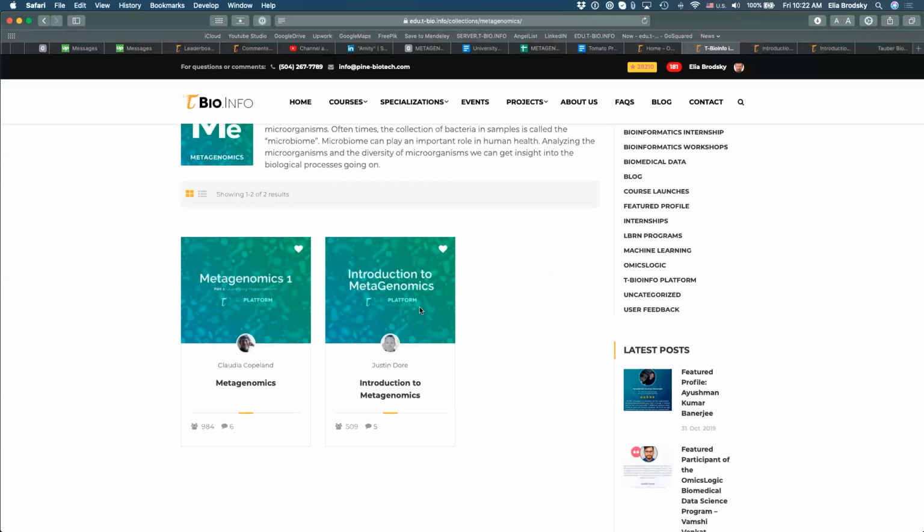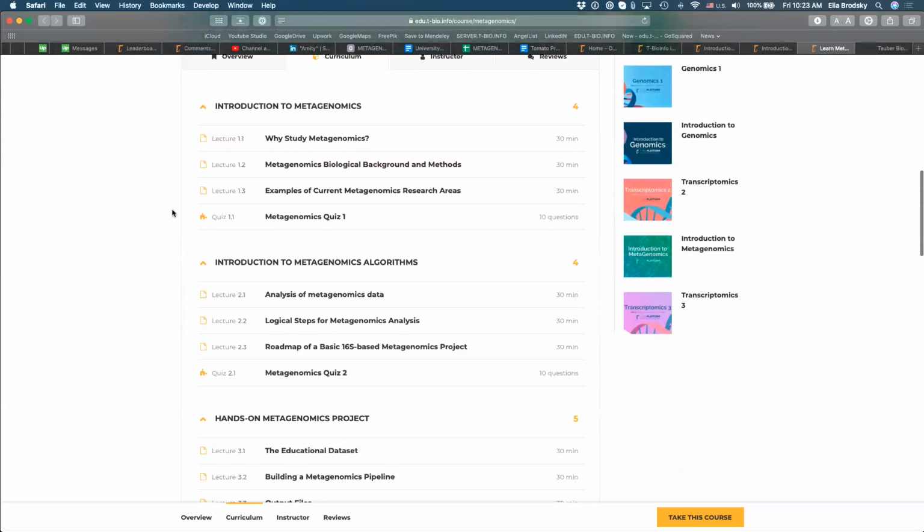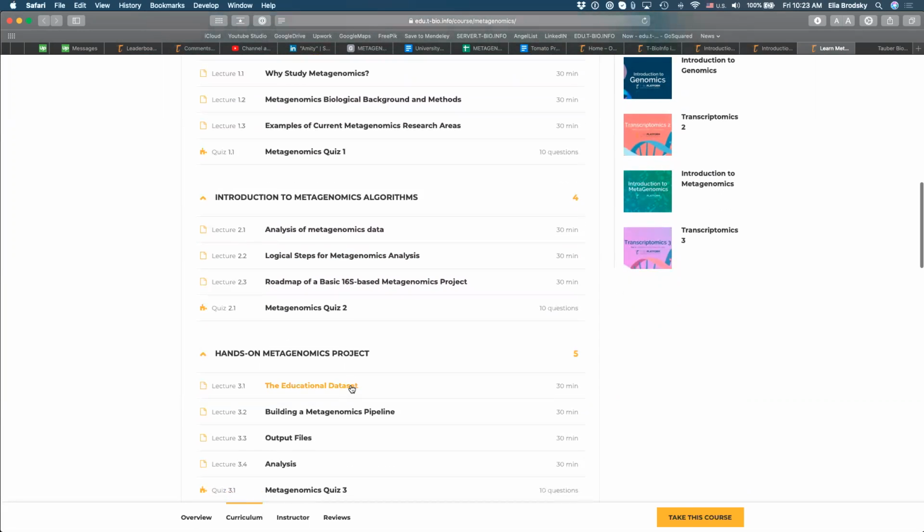And also, the Metagenomics 1 course will cover some of that information, more for logical steps of different types of metagenomic sequencing, including some example data sets. So you can look at some examples of where 16S ribosomal RNA is used and some places where the full assembled metagenomic sequence is important to analyze the data.